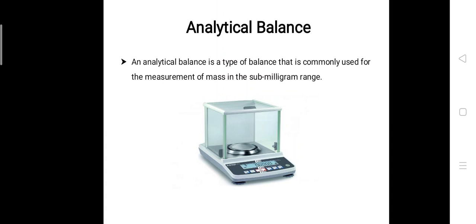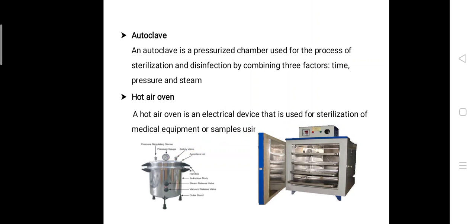analytical balance uses the force necessary to counteract the mass rather than measuring the mass itself. So this analytical balance also creates a force required to achieve a balance with the mass or the substance, and the resulting force is displayed. As they are highly precise and based on advanced technology, analytical balances are used in laboratories for the effective completion of tasks like weighing the test materials, then formulation, then density determination, then quality control testing, etc. So next we have here is the autoclave.